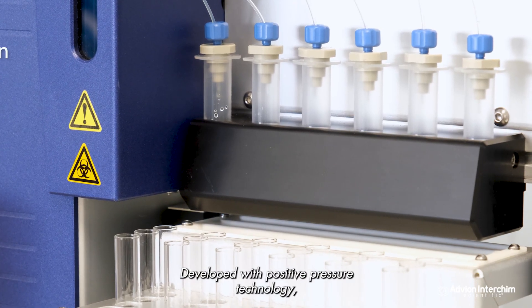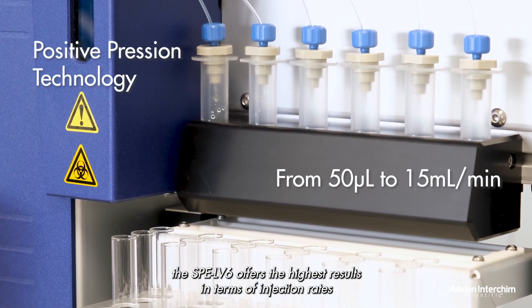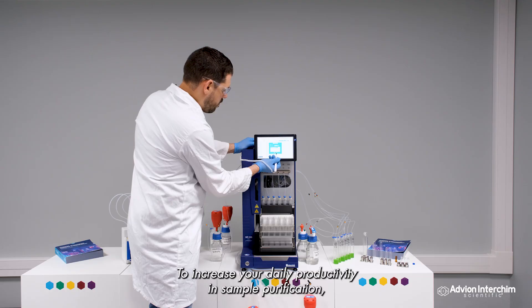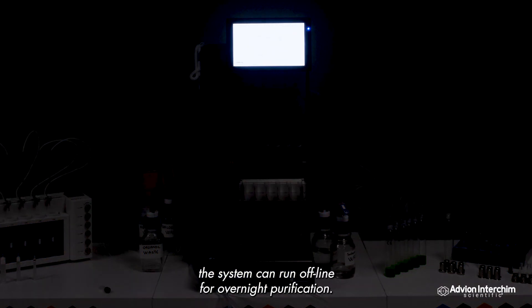Developed with positive pressure technology, the SPE LV6 offers the highest results in terms of injection rates and injection volumes with an RSD of up to 0.04. To increase your daily productivity and sample purification, the system can run offline for overnight purification.